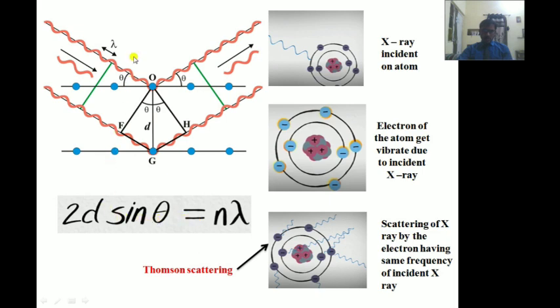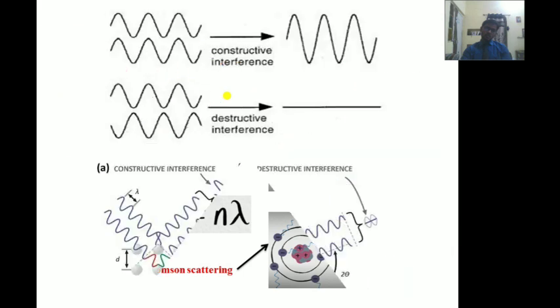Whenever Bragg's equation is satisfied inside the crystal structure, then and only then is a constructive interference pattern produced. And when this pattern is produced, the scattered beam forms a phenomenon called diffraction of X-ray, well known as X-ray diffraction. This X-ray diffraction creates an XRD pattern. Out of this XRD pattern, you may study many things like the a value, b value, c value, axes, then hkl values, planes, etc.